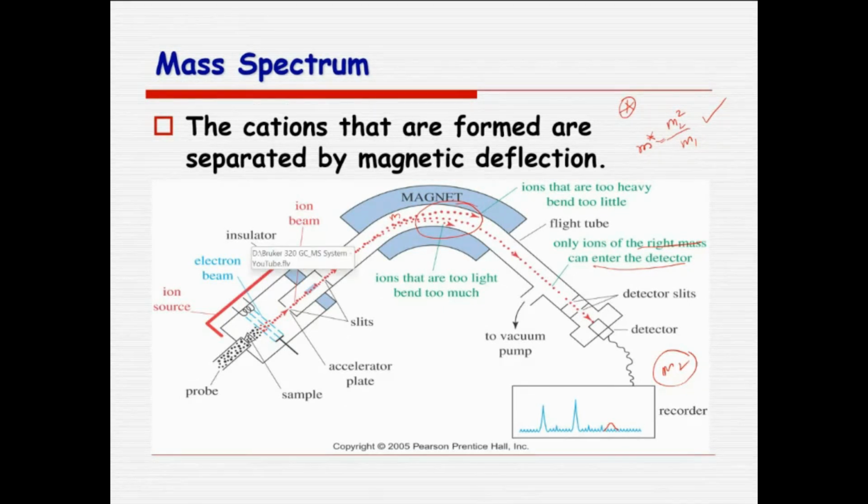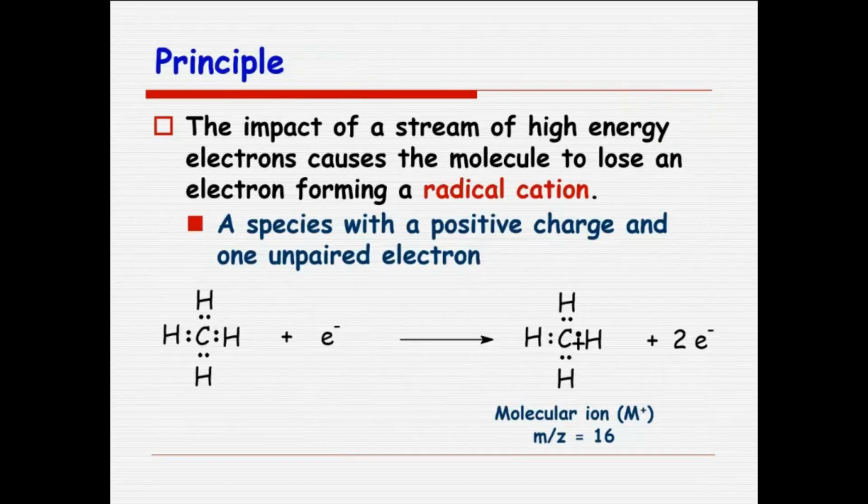First, in the ionization chamber, they get ionized as m1. But when they reach the detector, they reach as m2. So during the flight, they undergo further ionization. They are unstable. Here, what gets recorded is a metastable peak, called m star, which will generally be a blurred and broad peak. It is given as m star equals m2 square by m1. So you can find the mass by using that formula. Such questions are asked.